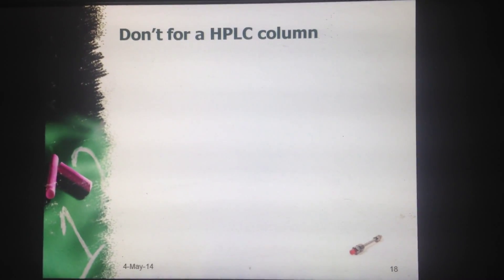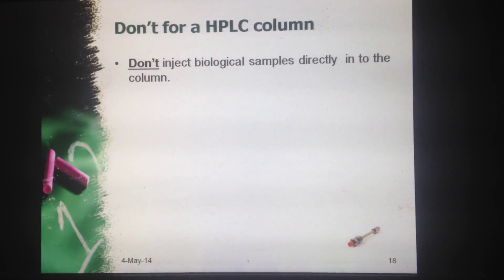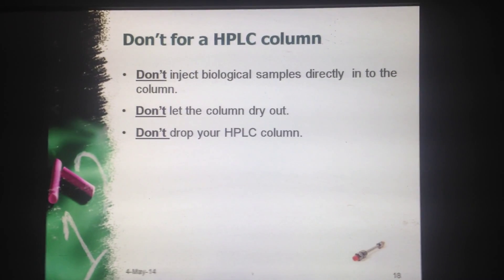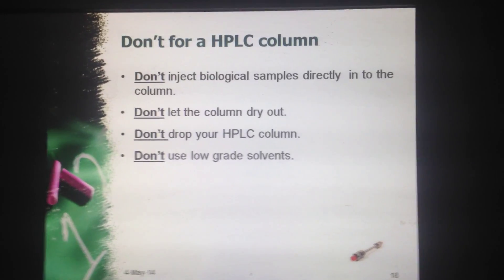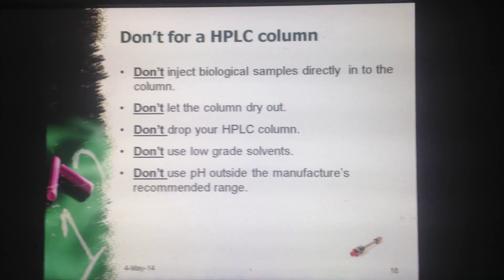Now what are the don'ts for the HPLC column? First, don't inject biological samples directly into the column. Second, don't let the column dry out. Third, don't drop your HPLC column. Fourth, don't use low grade solvents. Fifth, don't use pH outside the manufacturer's recommended range.